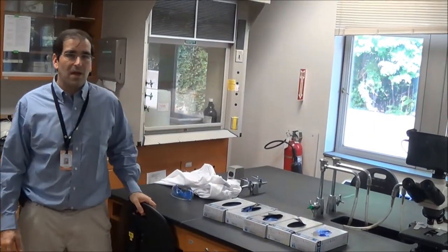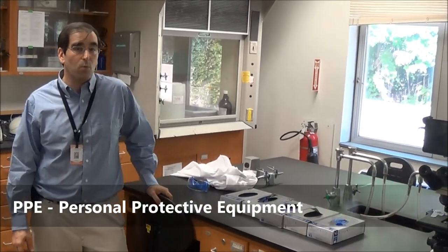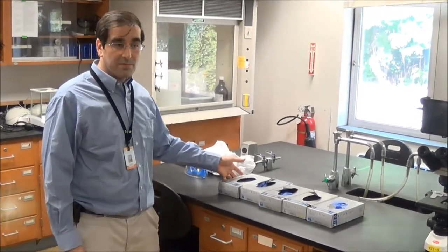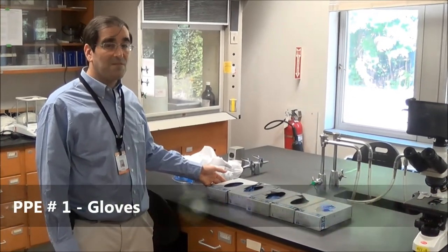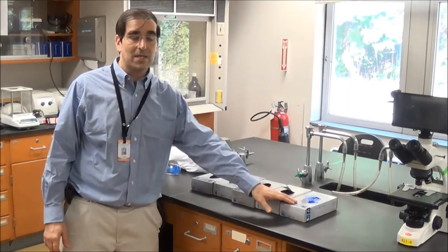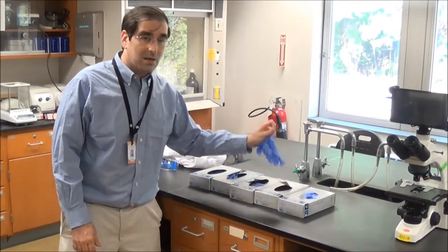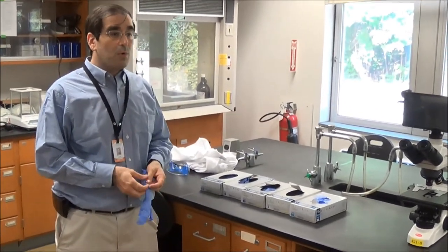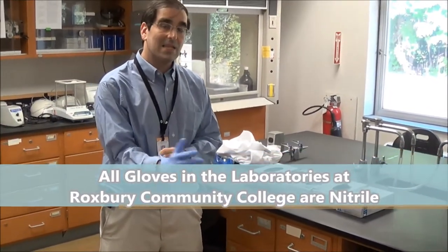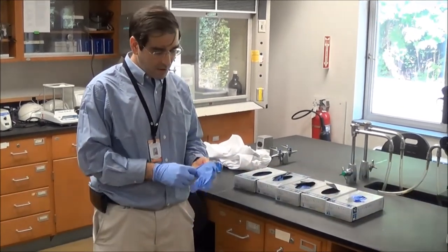I'd like to go over personal protective equipment, or PPE — the items you're going to wear in the laboratory to keep you safe. The first is gloves. In the laboratories at Roxbury Community College we have five different sizes: extra small, small, medium, large, and extra large. For those concerned about latex allergies, we do not have any latex gloves — all gloves are latex-free nitrile gloves, as indicated on the boxes. So you don't have to worry about that allergy.